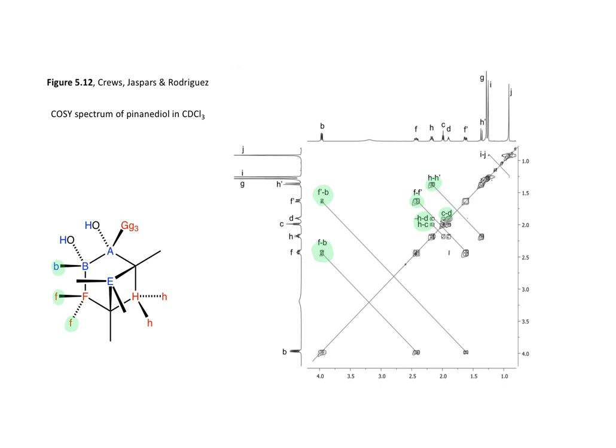So what that tells us is that there may be a connection between C and D involving 4-bond coupling.